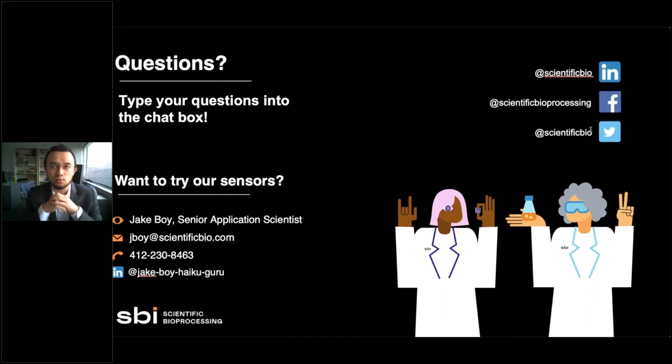And the way they did it was by microelectrodes. These are very small electrodes that fit in a needle, and they are able to hold the massive spheroid in place, and slowly inject the microelectrode as if it was in vitro fertilization. And then they just keep sampling oxygen as they go into the spheroid. That's the technology that I know for getting that data.